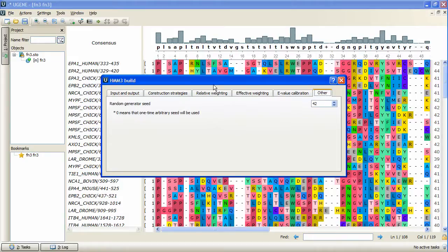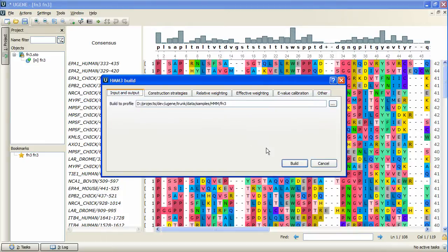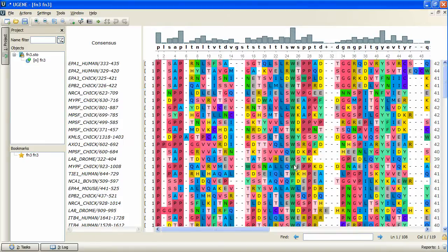When done with the options, we go back to the first tab and press Build. The profile HMM has been built and saved into the specified location.